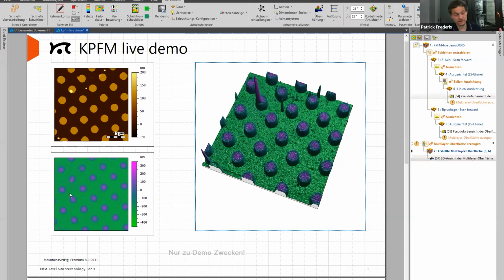So for a publication, I would move the sample a little bit to get rid of that contamination and find a cleaner area of the sample. But I think for the purpose of showing data and how to process data, it's okay that there is some contamination on it. That's okay, just showing how live is.